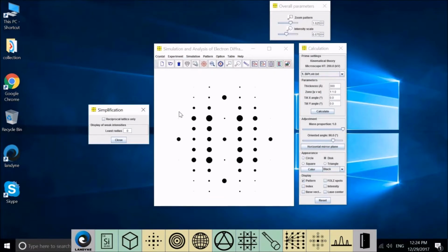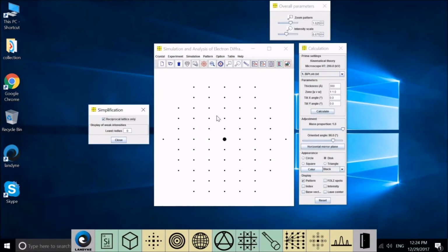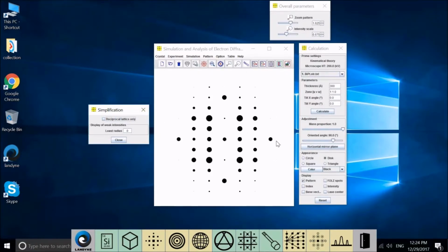And for teaching, you probably sometimes need to show the reciprocal space and the diffraction pattern, the relation between them. And notice that those are extinction spots. Whenever we change the weak spot, those keep 0 there and will not be affected. So even when this one is enhanced, this extinction part will not show up.